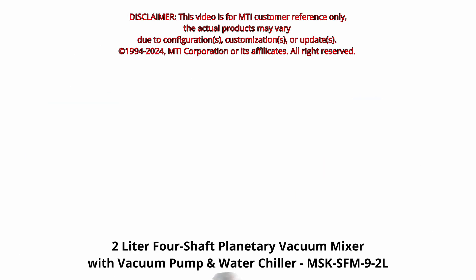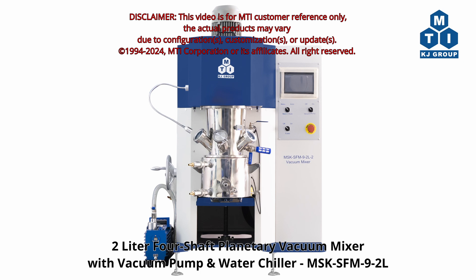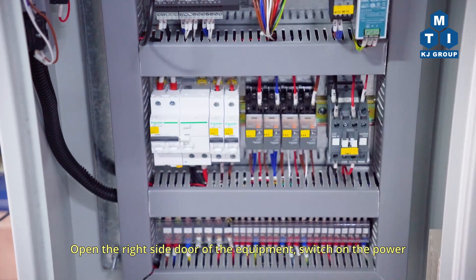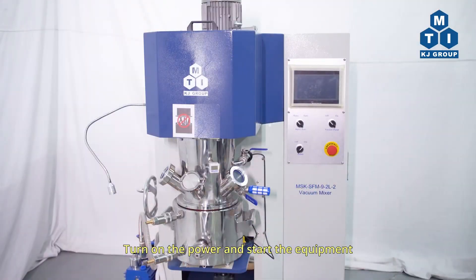2-Liter 4-Shaft Planetary Vacuum Mixer with Vacuum Pump Water Chiller MSK-SFM9-2L. Open the right side door of the equipment, switch on the power, and start the equipment.